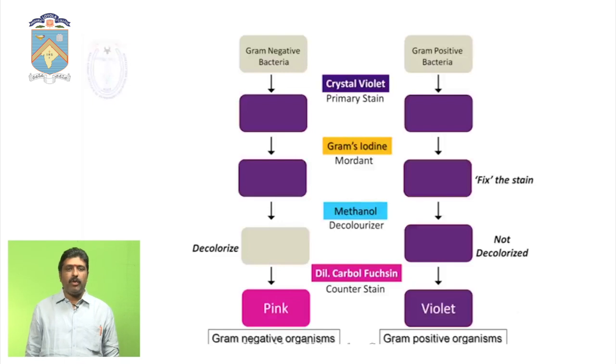Why do we call it the counter stain? Because it is the last stain used in this staining technique. So, that is the counter stain.